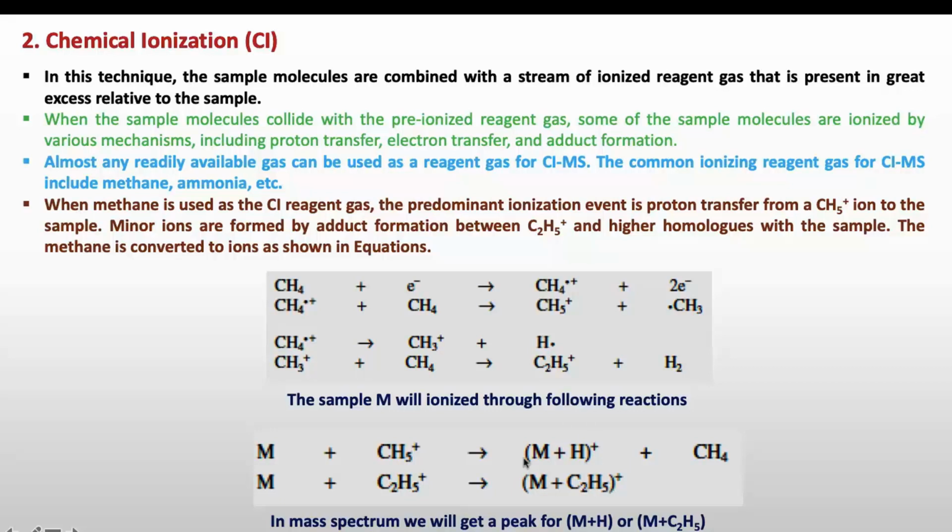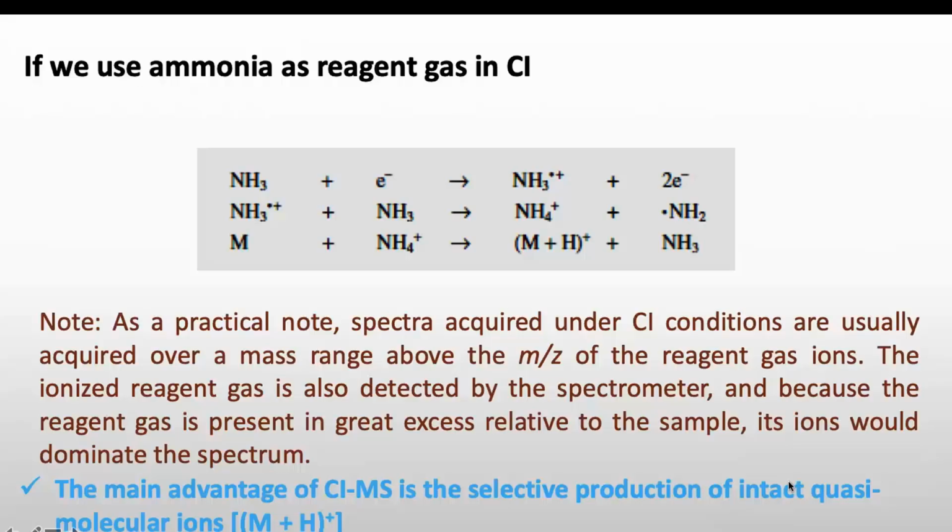Now the mass analyzer can detect it, or we can control it. But in the mass spectrum, we will get a peak of M+H or M+C2H5, not M+. Now, if we use ammonia as a chemical ionization gas or reagent, first NH3 will lose an electron and convert to this ammonium radical cation. Now this ammonium radical cation will collide with another ammonia molecule and convert it to this ammonium ion. Now this ammonium ion will collide with our sample molecule and convert it to M+H by proton transfer. So now in the mass spectrum we will detect the mass of M+H instead of the mass of our molecular ion.